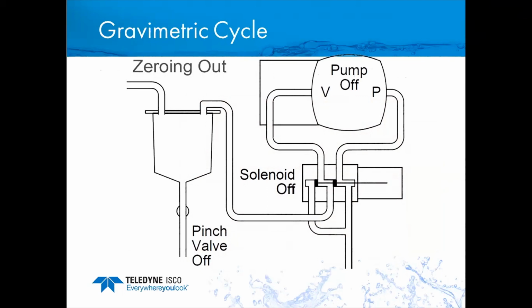The first portion of the pump cycle for the vacuum sampler that is using the load sensor is it will zero out all the material, the chamber, and associated components to get a zero weight on that chamber.